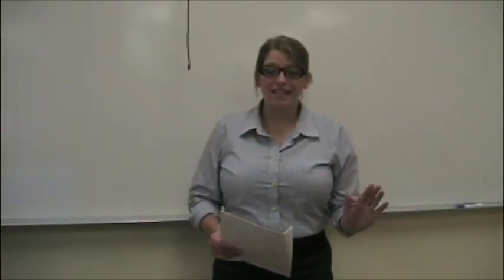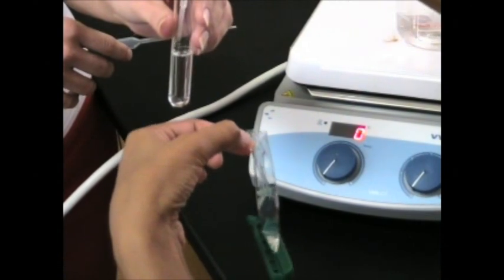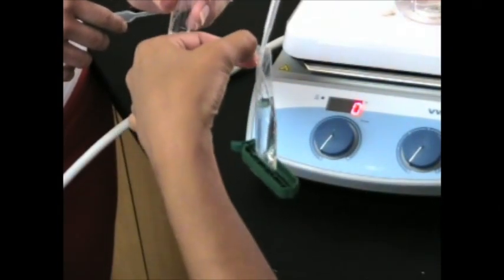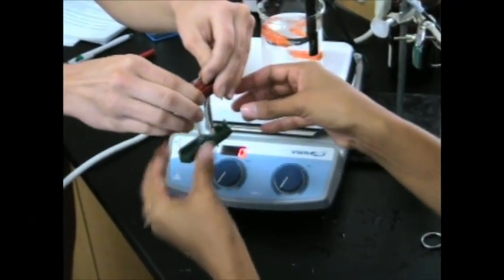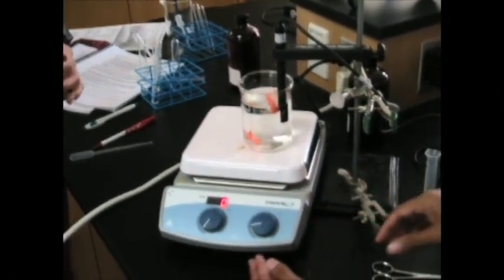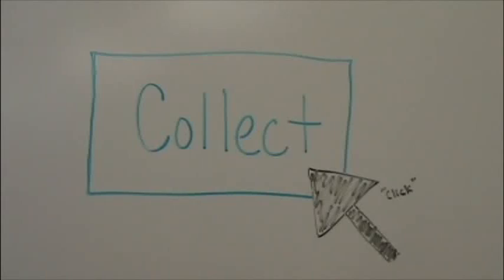The next thing I'm going to explain is the Vernier conductivity probe, which we'll use to measure the diffusion of ions through a membrane. First, measure out 10 milliliters of saline solution using your pipette skills, then squirt the liquid into a permeable membrane and place it in a beaker filled with water. Enter the Vernier conductivity probe into the water and turn on the magnetic stirrer. Make sure the probe is connected to the computer and ready to collect data — it works best when it is equidistant from the saline solution in each trial. Press collect on the computer and watch the data come up on the screen.